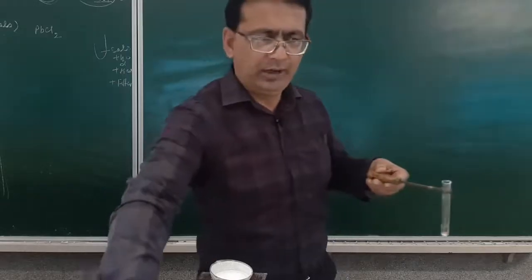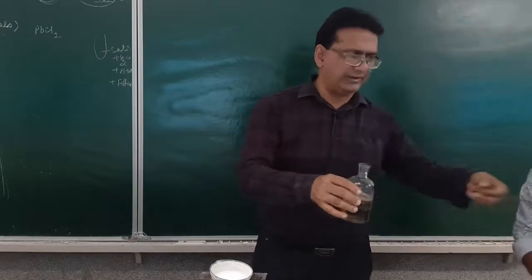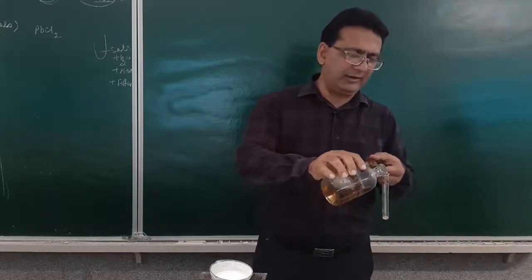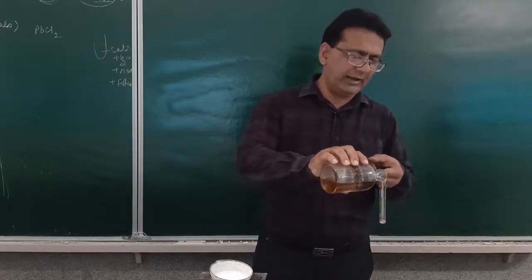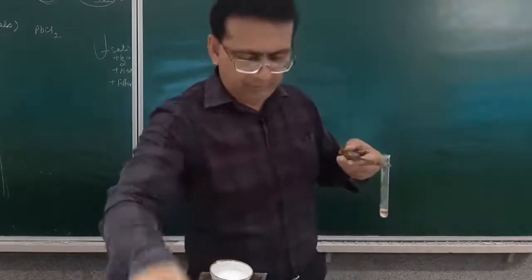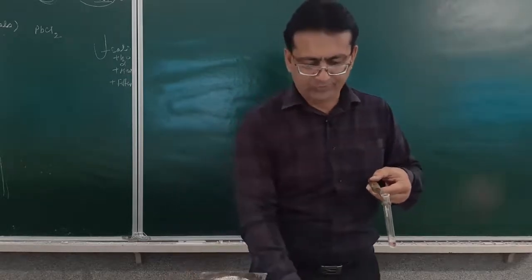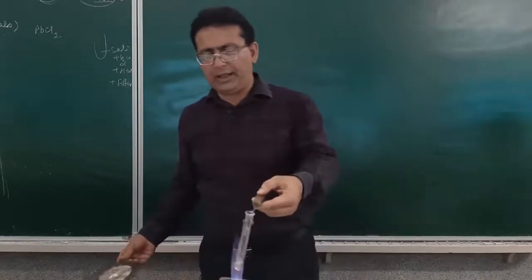When I add the concentrated sulfuric acid, you may again see, student, how I carry out this test. We heat it again.